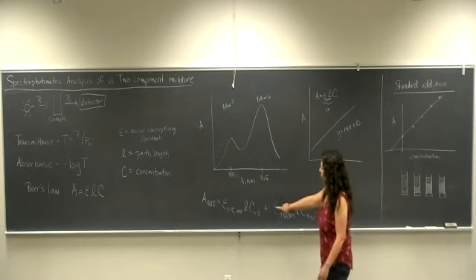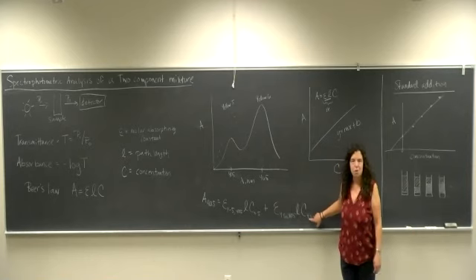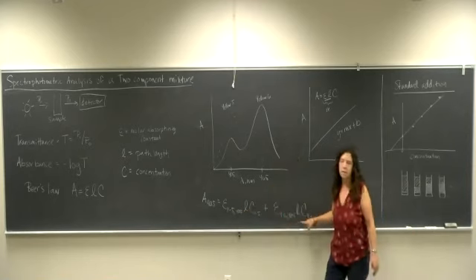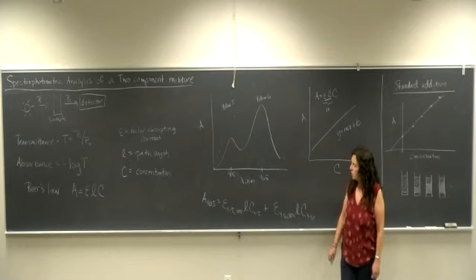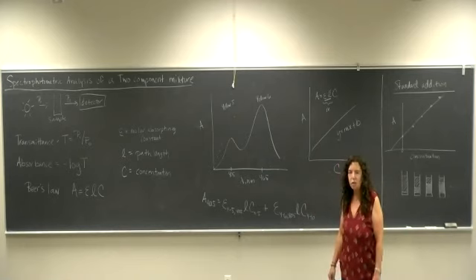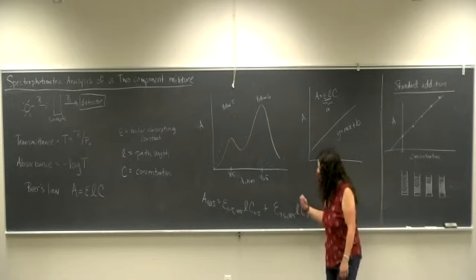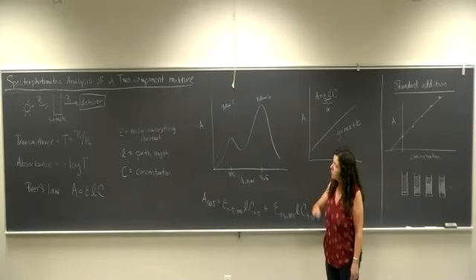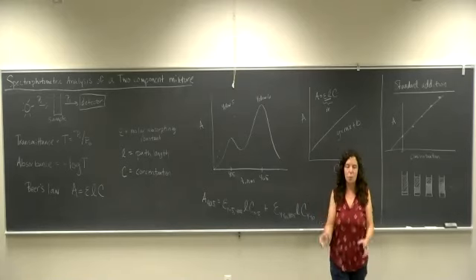Your unknowns being the concentration of yellow 5 and the concentration of yellow 6, and your two equations are this one right here, and then the same one written for the absorbance at 465. And so then you do a little math and you pop out the concentrations. And then you will know the concentrations for an unknown concentration two-component mixture.